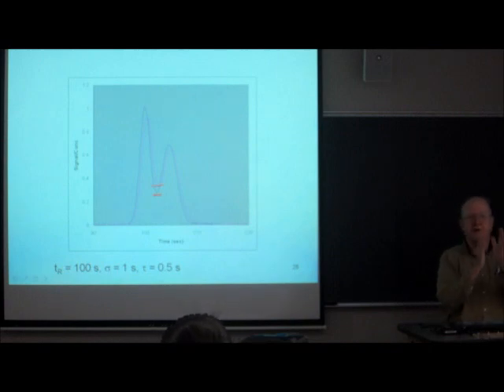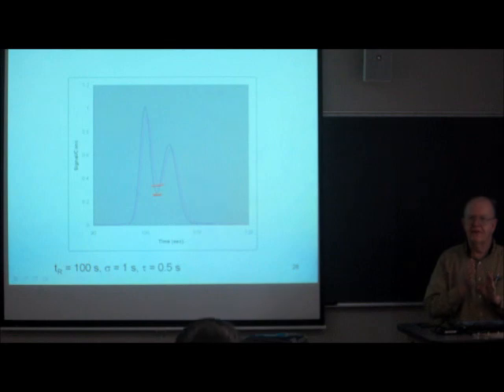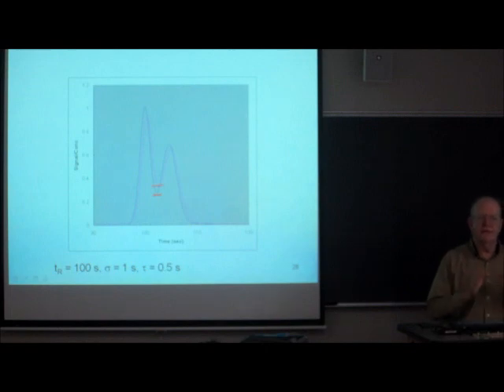So if you have peaks that are close together, not only are you making the peaks wider, but you're destroying part of your resolution. And that's another big problem. So you have to set the time constant to be just enough to reduce the noise, but not too much so that you screw up the resolution of any pairs of peaks that are really close together.